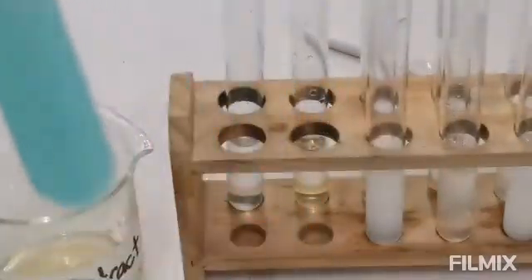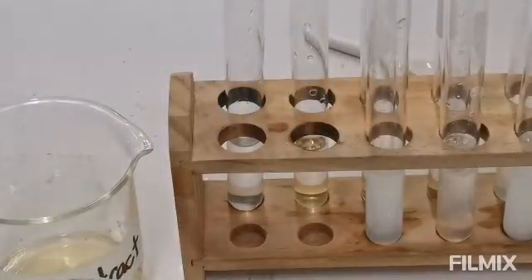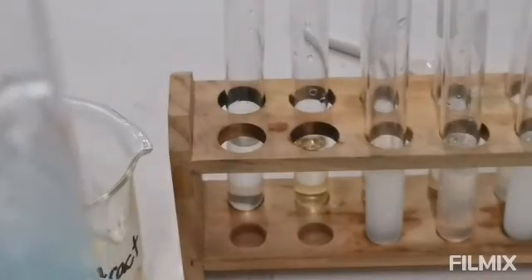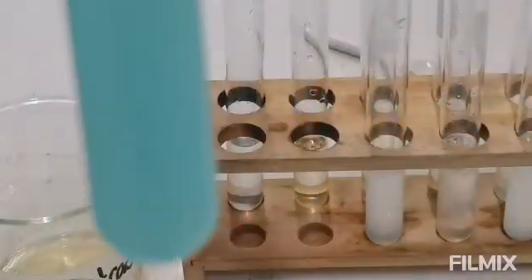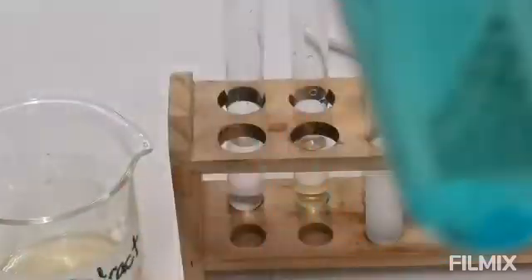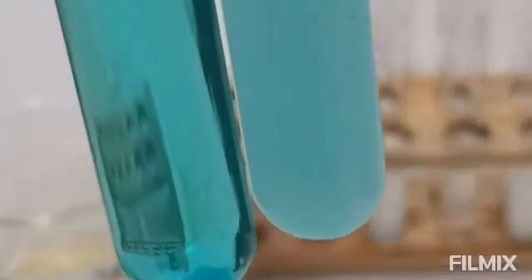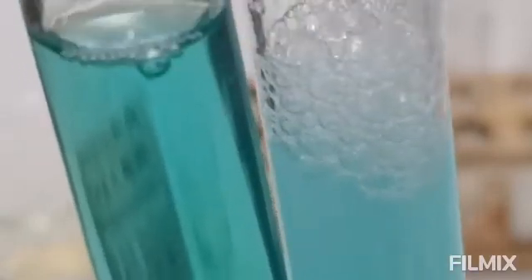I think you can see the solutions. So this one is with the egg albumin, and this one is with the beef extract. These are both added with sodium hydroxide and copper sulfate.